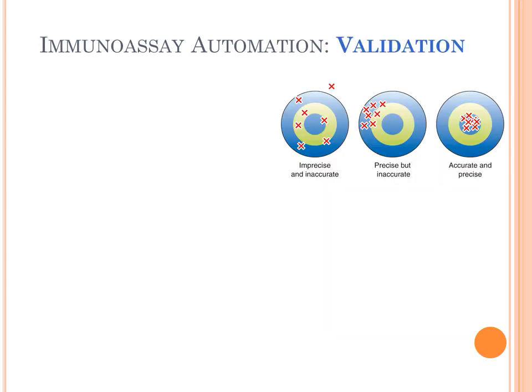The term validation is really a term that includes the measurement and the parameters of a given assay and the assurance that that assay is doing what you think it's doing, what it should be doing, whether it can be trusted. So let's say you're in a lab and a new piece of equipment is purchased to do test XYZ. You don't just have it delivered, open the box, set it up, and run with it.